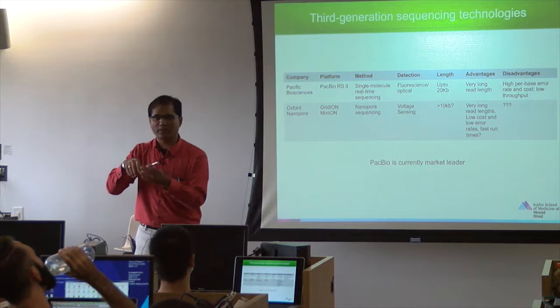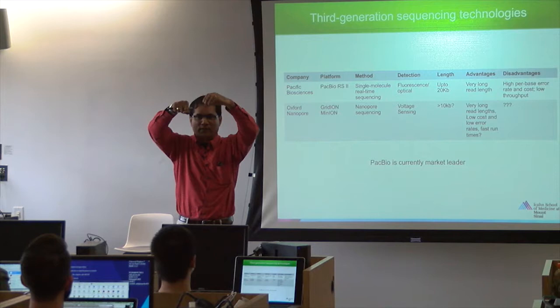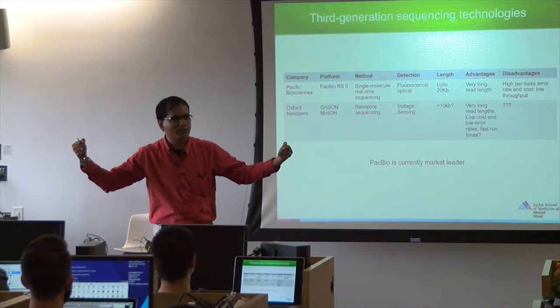You are able to understand what I'm saying without showing any slides, right? So when you add a fluorescence here, like a dye terminator, fluorescence is there on the ring, but you have to remove that fluorescence to add another fluorescence. But if you are not removing anything now, your bases are being continuously added, you are videotaping, how do you remove that fluorescence? See, all these practical problems are there.